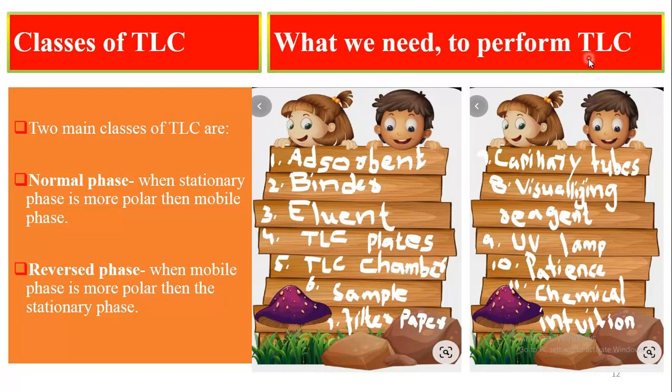For performing a TLC, what we need: adsorbent, binder, eluent, TLC plate, chamber, sample solution, filter paper, capillary tubes, visualizing reagent, UV lamp, and chemicals.